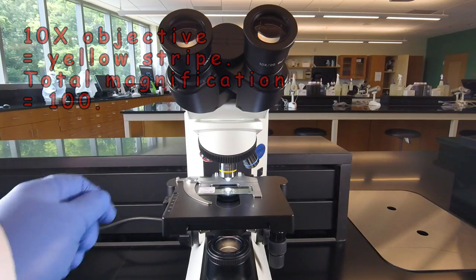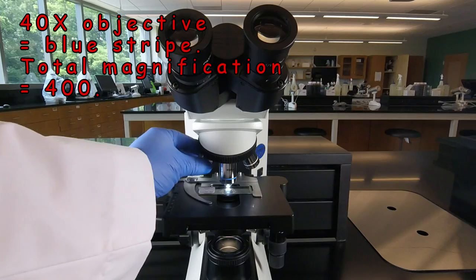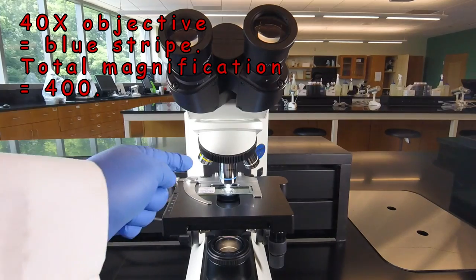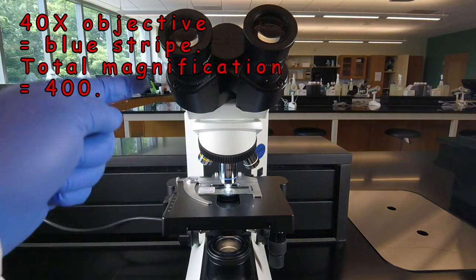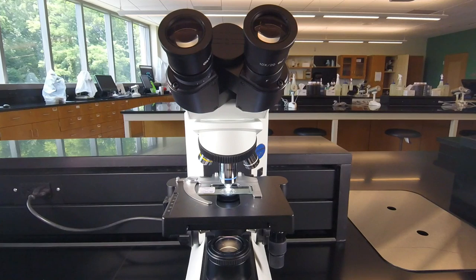If we rotate the blue striped objective into place, that's a 40x objective. And so the total magnification is 40 of the objective times 10 of the eyepiece. We're seeing the image 400 times its real size. That's sometimes called the high dry objective because we don't put it in a drop of oil.